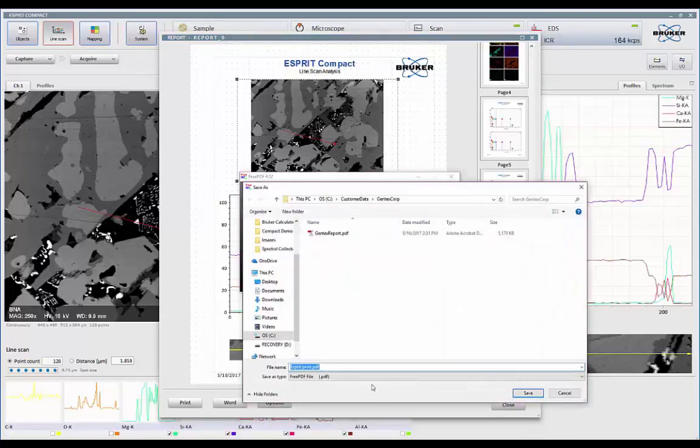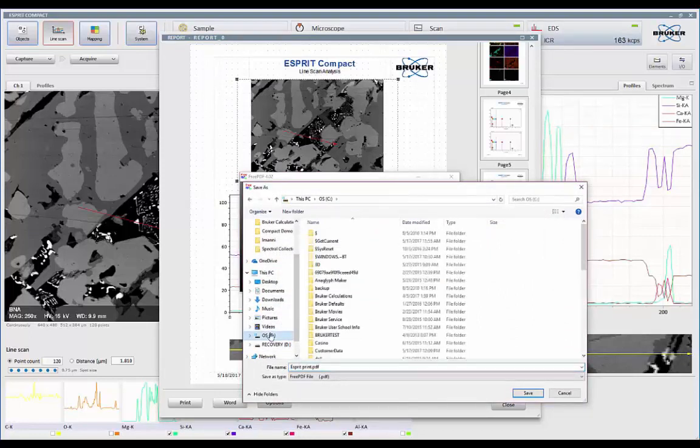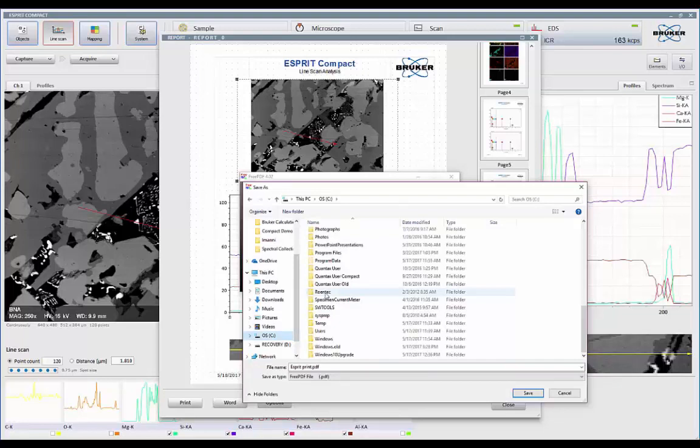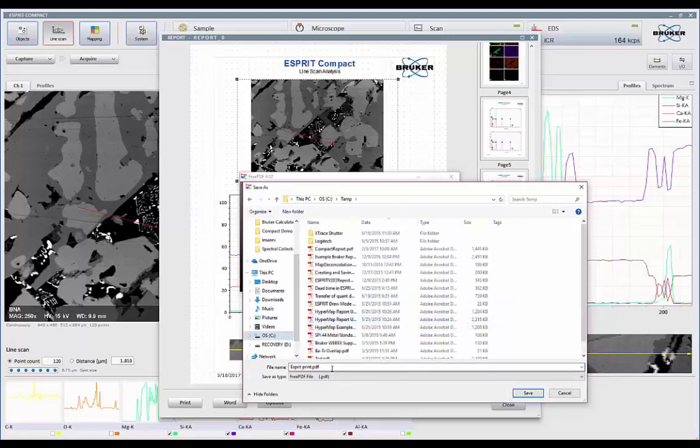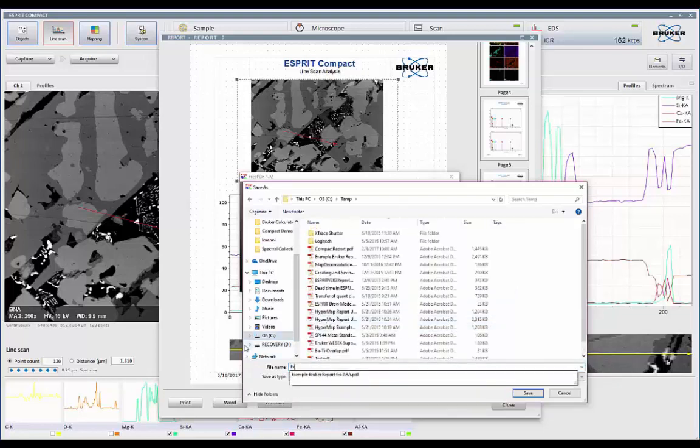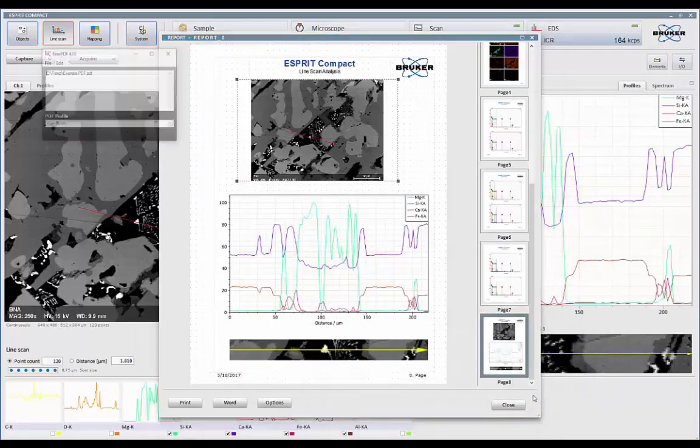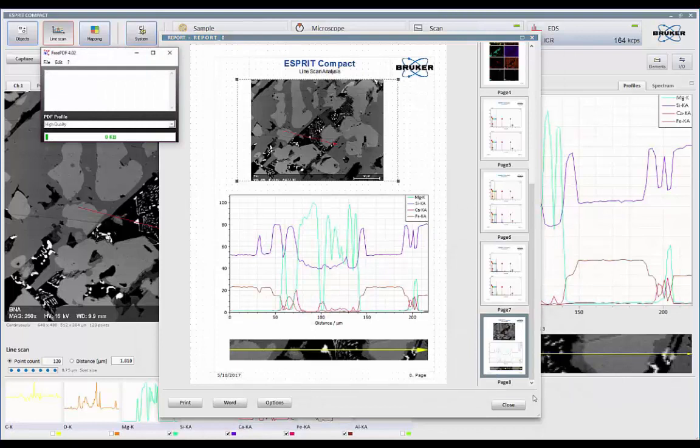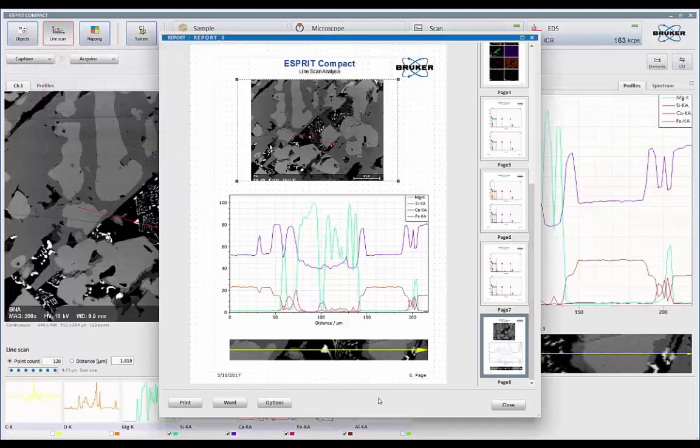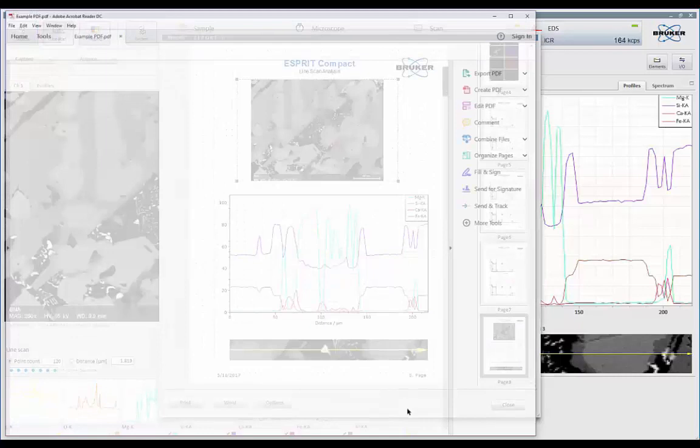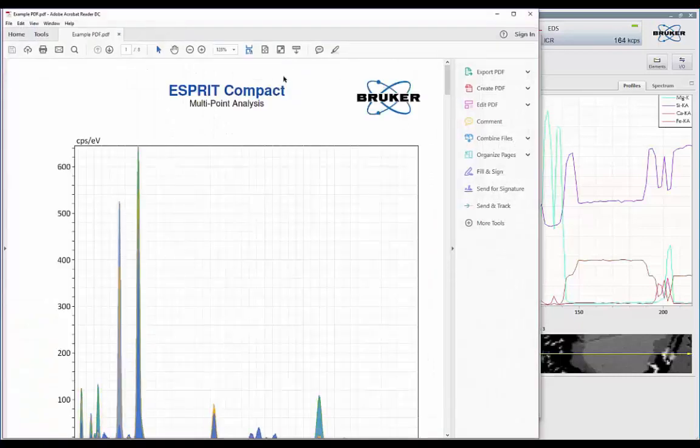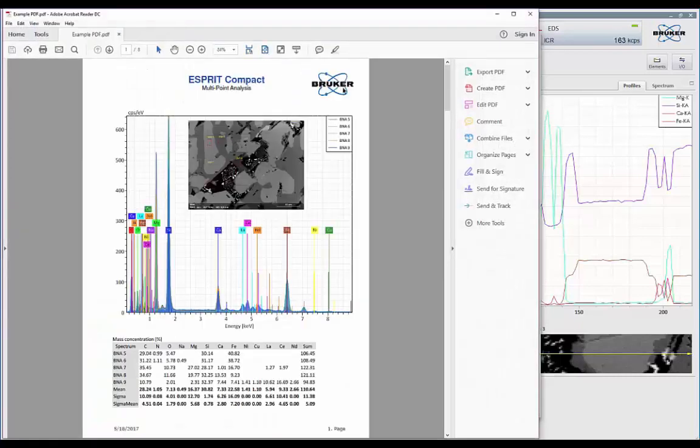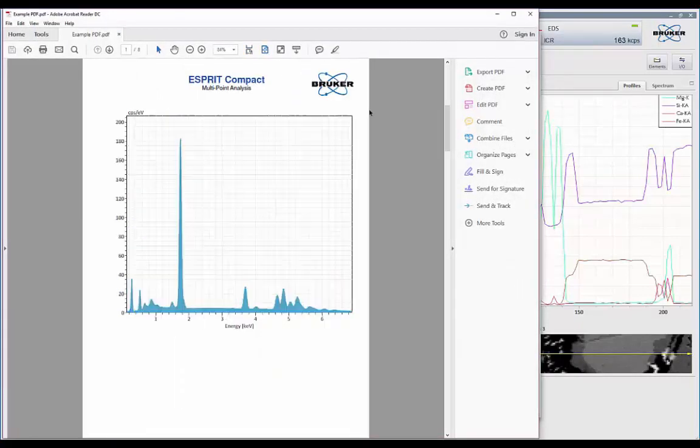So we can come in here now, give it a location where I want to save the data. So I'm just going to put it into a temporary file right now. And call it example PDF. Hit save. So it's transferring all the data over to the PDF. And when we're done, that's what we'll have. So now I have my PDF file with all my results.